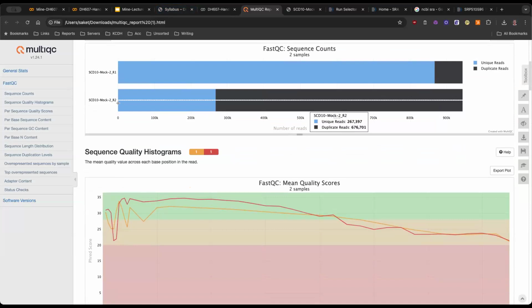Good question. I did not elaborate upon it because this tool I'm showing you is one people use and like. It's a good tool. But honestly, this step of checking the quality manually is kind of obsolete. We have good adapter trimming tools now, so they take care of everything. So I don't even check these files. But I think you should check, right? You should always check. But I don't check personally. I don't check quality scores anymore.